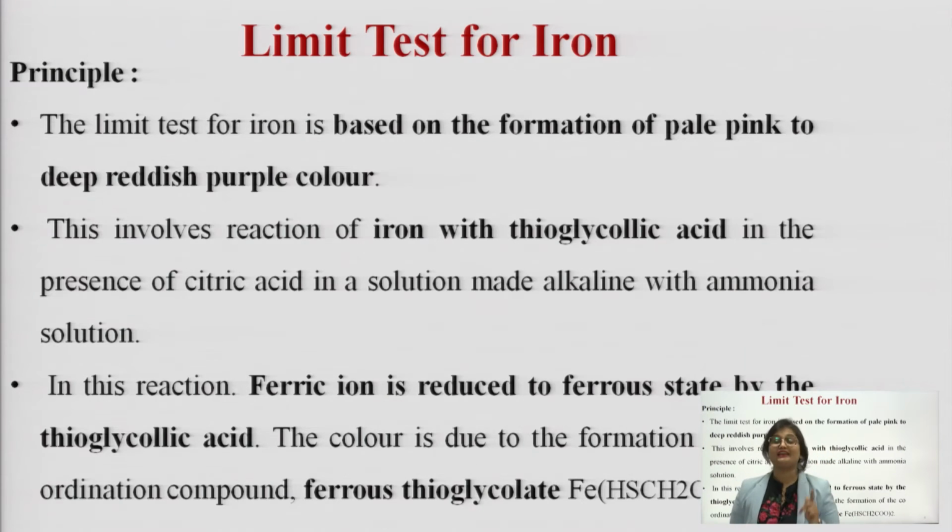Principle is followed by the reaction, the chemical reaction which is happening inside the system. Followed by the procedure, followed by the reagents used for performing the limit test.